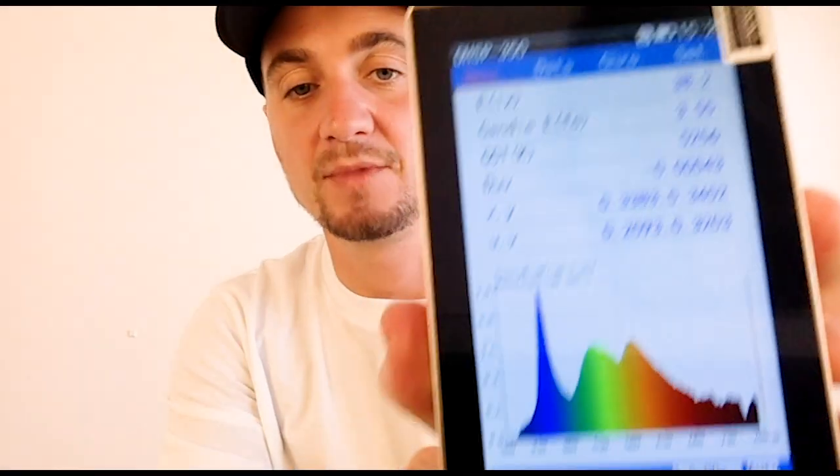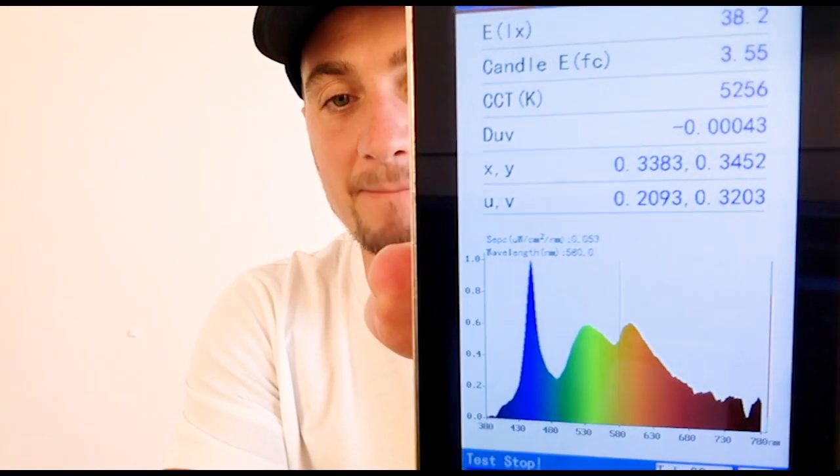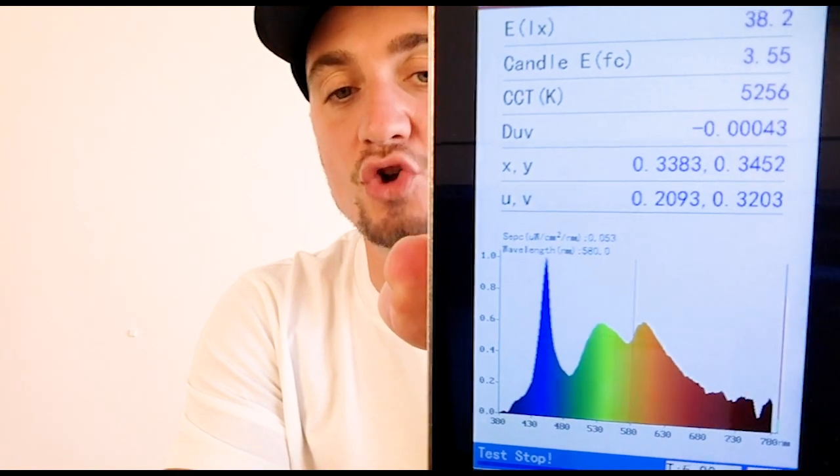I want to show you on this spectrometer what it looks like to look at a computer screen. I'm going to test the screen I'm working on right now because I've taken my Iris software off this. It's just calibrating right at this minute. There you have it — that's the spectrum test result for the LED backlit MacBook that I have right here.